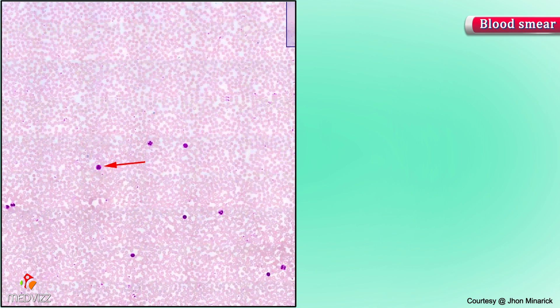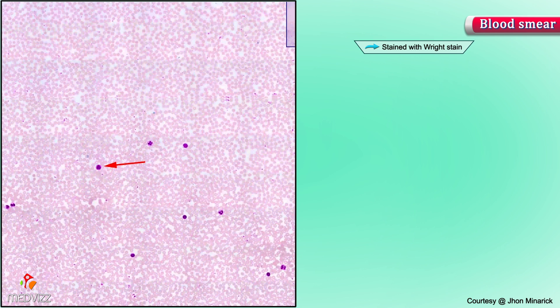Here is a classical smear of blood, called a peripheral smear. In a peripheral smear, the stain that is used is not H&E. It is called a Reitz stain, which is a slightly different type of stain, but nevertheless nuclear material is more bluish and cytoplasmic or non-nuclear material is more pinkish or reddish.